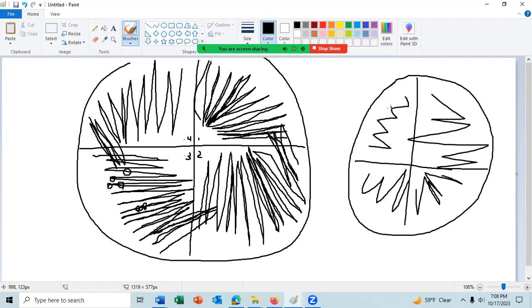And if you have an isolated colony here, the cells in this colony went through 2 colony formation events. Once in this plate, and then once from this plate, because I took from one colony to set up this plate. And those cells will be over 95% pure, meaning over 95% of the colonies will be pure on this plate. Any question about that?